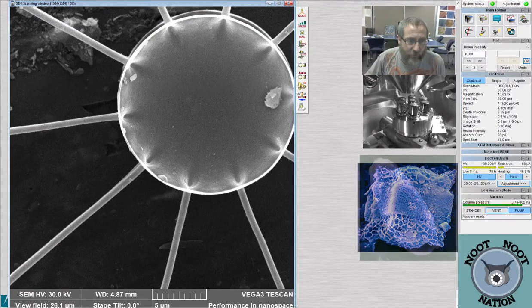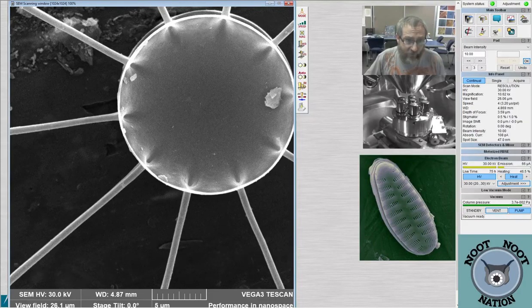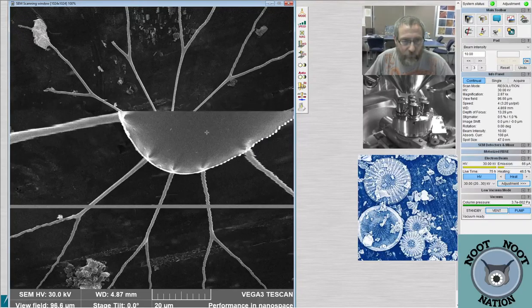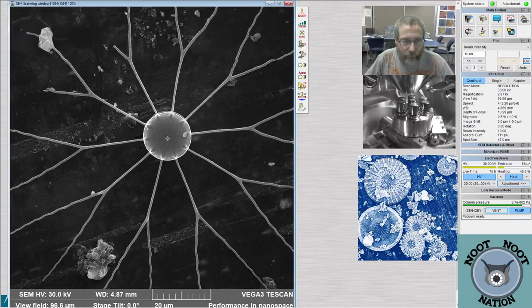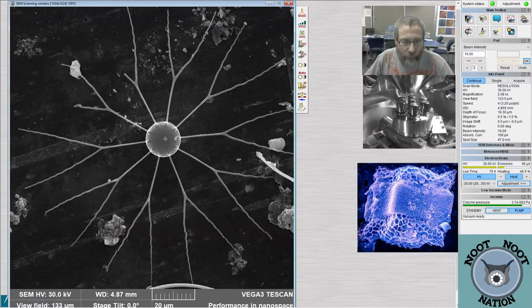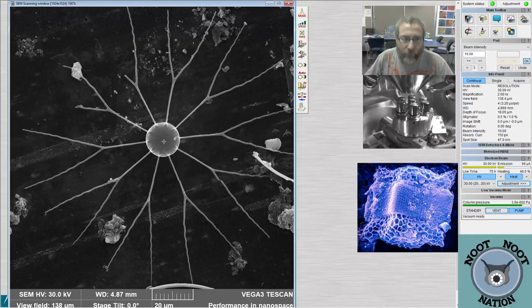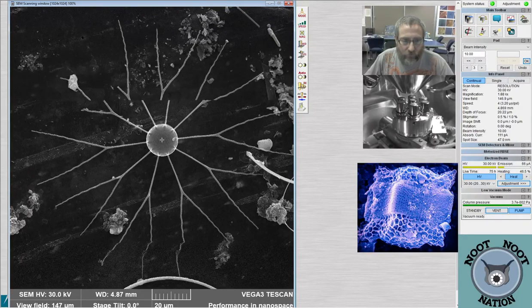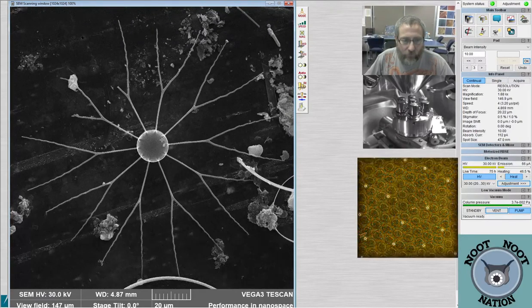And so I think what they're doing is they use these as like cell extensions, like a way to get their chloroplasts out into the light away from the colony for food. And that's really interesting because I've only seen some of them chucking their chloroplasts out into their setae. A lot of them I just see are clear. I don't know if that's a species thing, that some of them do it and some of them don't. It's just I don't know enough about the chloroplast and the way they move inside the cell structure.